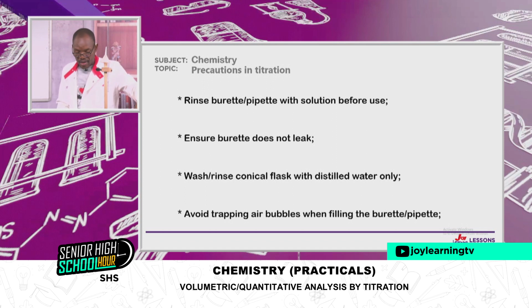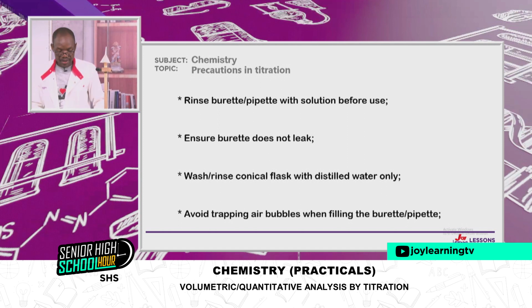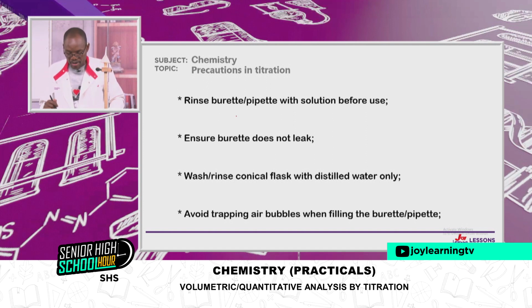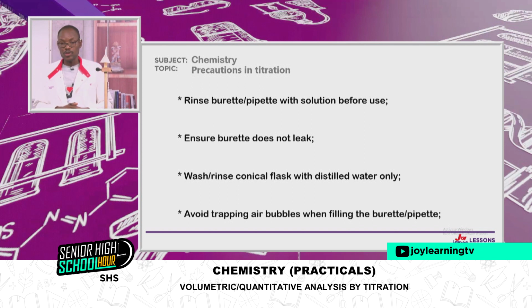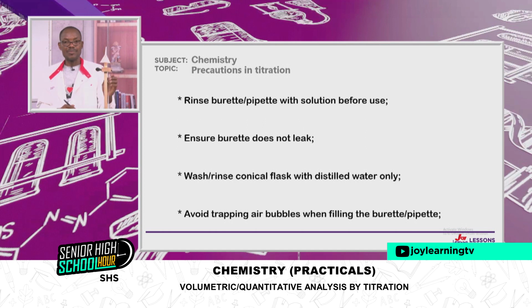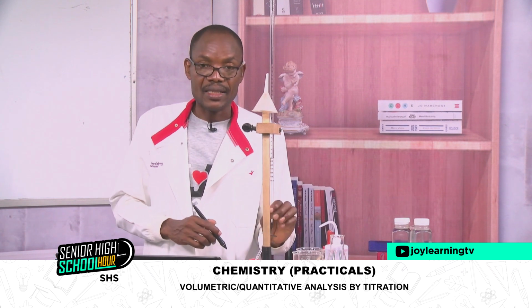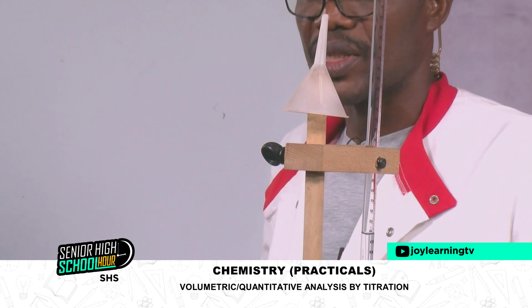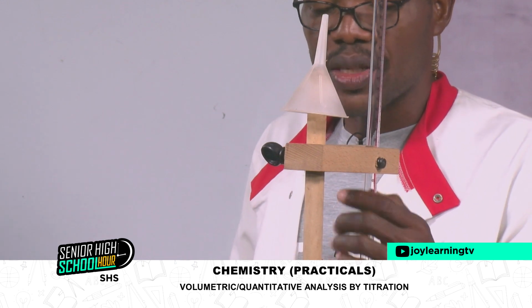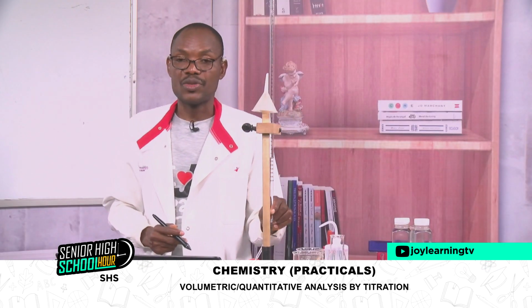The next thing, so if those errors can appear, then how do we prevent them? Let's look at precautions in titration. Number 1, rinse burette or pipette with solution before use. So if, for example, I'm going to use the acid in the burette, I have to rinse inside the burette with the acid after rinsing with distilled water. You are conditioning the burette. You are removing any contaminant in the burette. So that process is very, very necessary for accuracy.